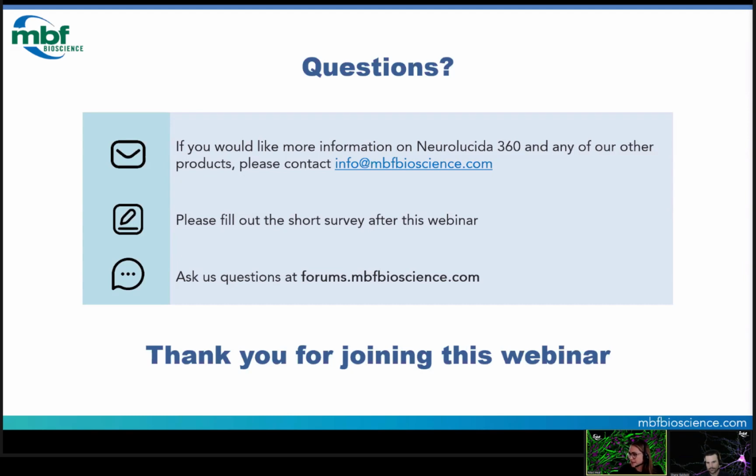So let's take a look at the questions that are coming in, Shane, and we'll hopefully get to all of them. All right. So a question here: does each file need to contain only one cell, or can it contain many cells? Each file can contain many cells, or just one cell. The detection algorithms will find many somas and trees from all present cells within the microscopy image that you've imported into Neurolucida 360.